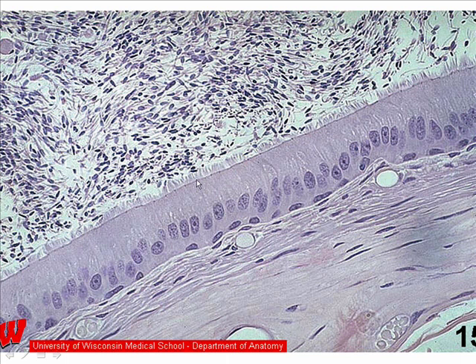You'll note at the junctions of the apical portions of the lateral surface of these cells, there are little points. And these little points are the junctional complexes that provide a very tight seal of one epithelial cell to the next to prevent anything from going in between the cells, which is called the paracellular pathway.